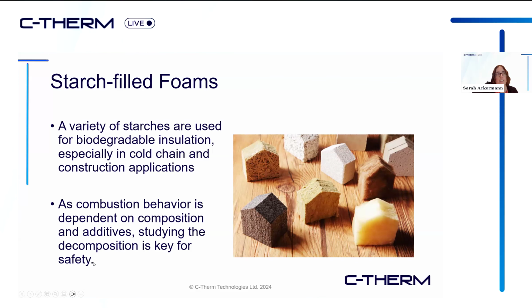But in the case of these starch-filled foams, or the foams that are being made out of starches, the combustion behavior of these materials is dependent on the composition, the structure, and any additives that are in the foam material. So it's important to actually study the decomposition, because one thing that we can't do is make the assumption that the starch foam is just going to behave like a powder would or like a block would.